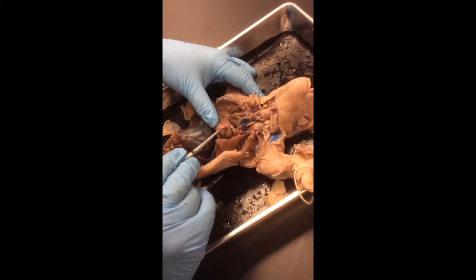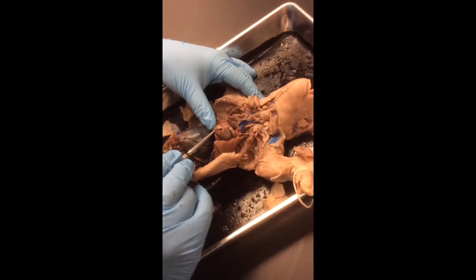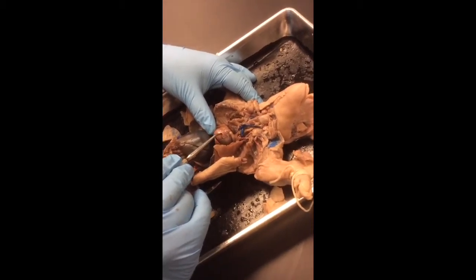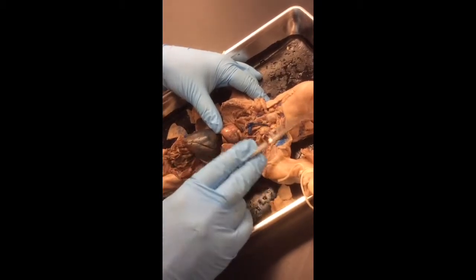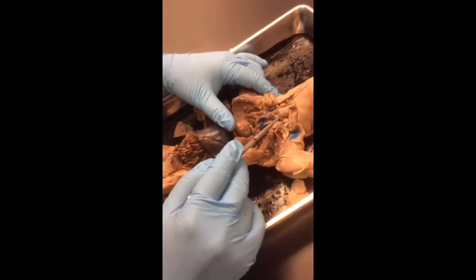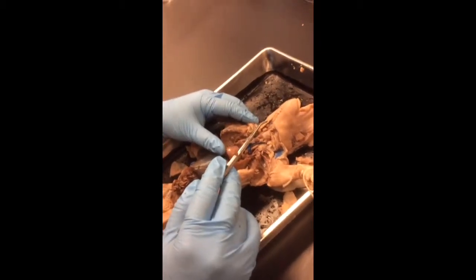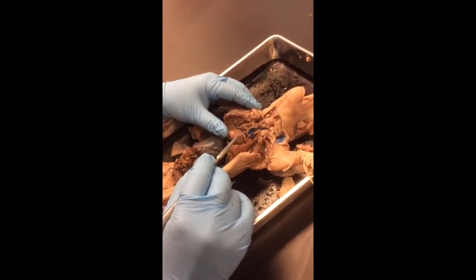Just a quick note, these arteries right here on the heart itself are called the coronary arteries. If those clot, that gives you a heart attack. If the other ones clot up in the rest of the system, that'll cause a stroke. So you're not going to need to know where the left and right ventricle are, but you're going to need to know that stuff for the pathway on the written part. The AV valve, semilunar valve, you won't need to know.